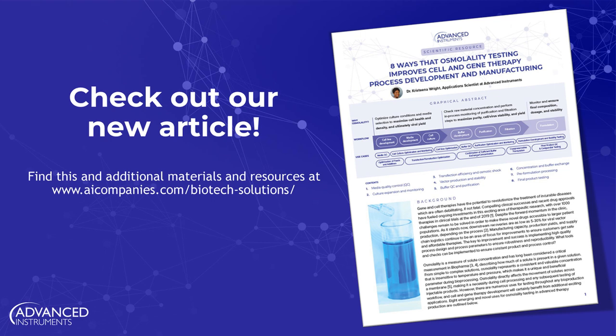Perfect, thank you. We also have another question, more for the upstream application. How can we study the effect of osmolality? Do you recommend tuning the osmolality by changing only sodium, or a combination of contributing factors such as sodium, potassium, and glucose? Sure, that's a great question. There's clearly a number of osmolytes and solutes that are going to affect osmolality.